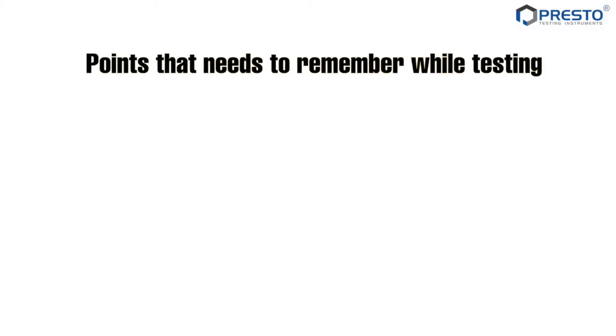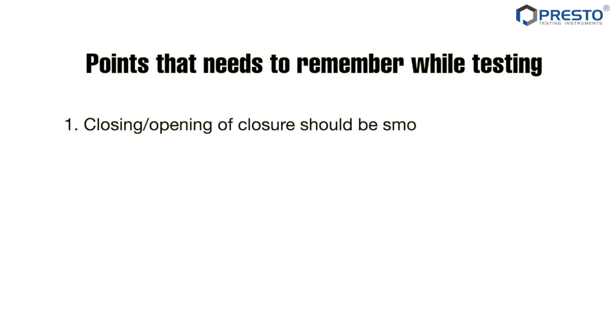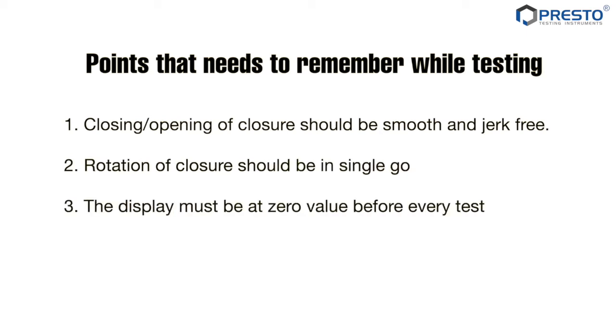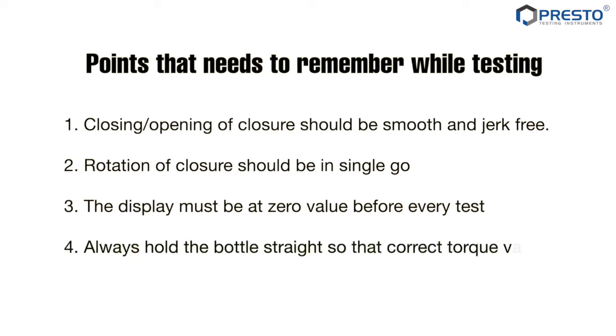Points to remember while testing: opening of the closure should be smooth and jerk-free, and rotation of the closure should be in a single go. The display must be at zero value before every test. Always hold the bottle straight so that the correct torque value can be examined.